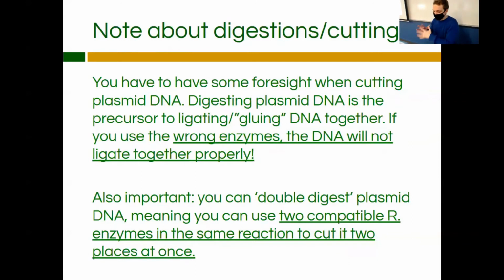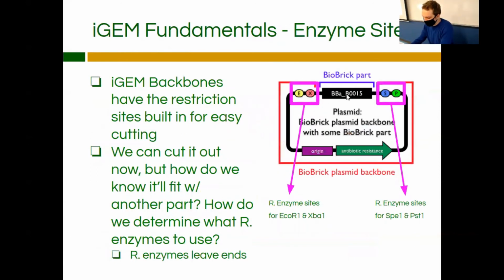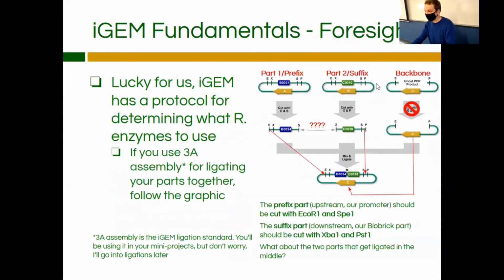Luckily, iGEM has a thing for that, but also you can use 2 restriction enzymes in the same tube at the same time. So back here, say there's this part, we don't have to cut it one by one. We don't just have to have this plasmid in there with XbaI. We can have it in there with XbaI and PstI. So you can cut it on both ends at the exact same time, with one end having the XbaI overhang and the other end having the PstI overhang. And that's called double digestion.